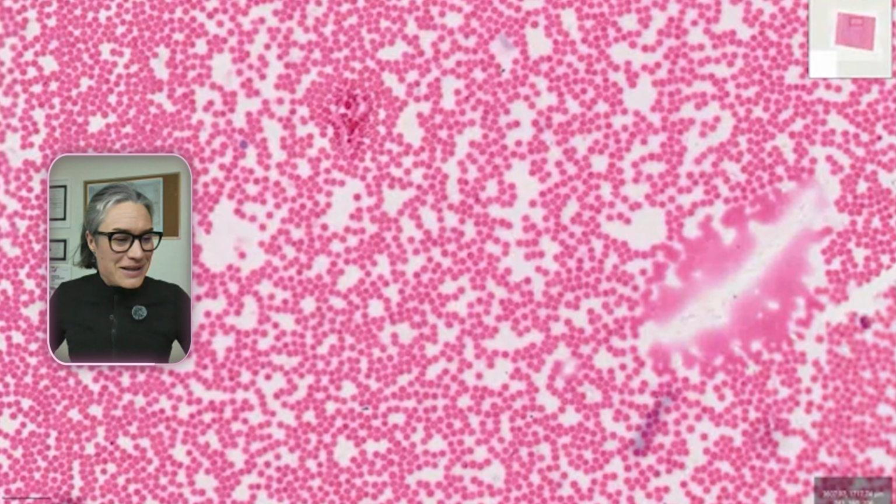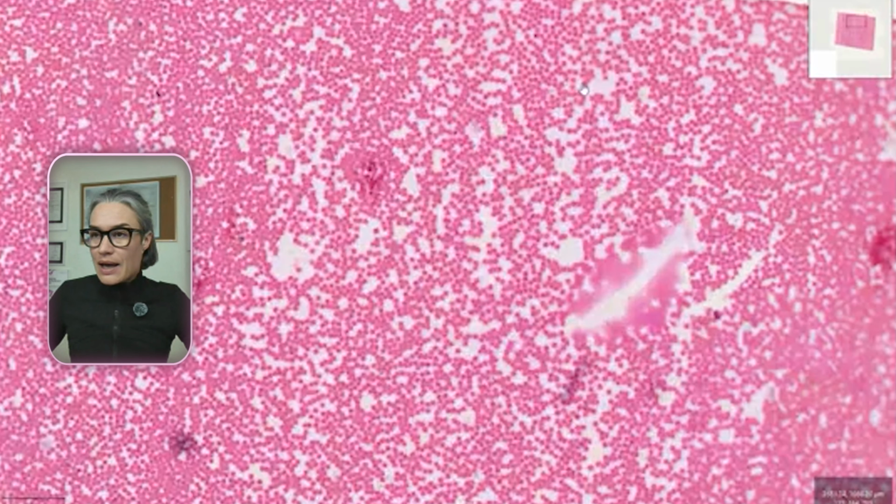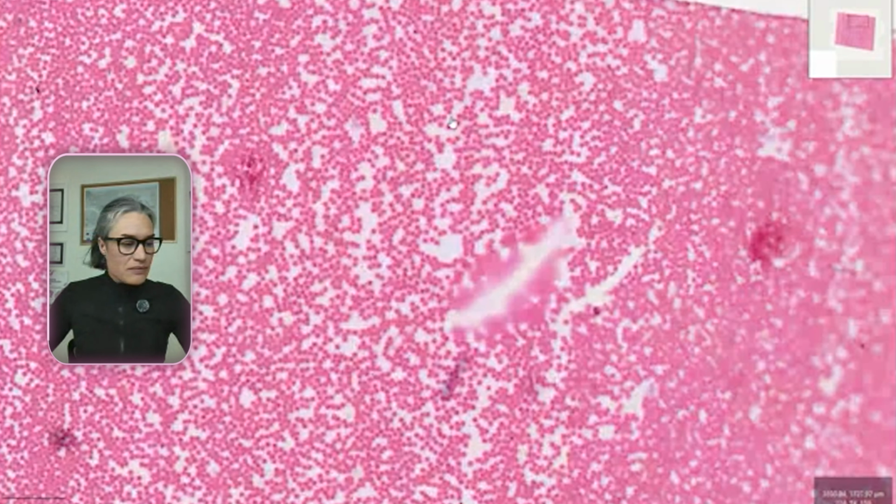This is how blood looks under the microscope. And this is human blood, at least according to the label of the slide that we have. I did not create the slide, but I see the features of mammalian blood, because most mammalian blood looks the same, including humans. So let's look at the cells that we just identified on our infographics.